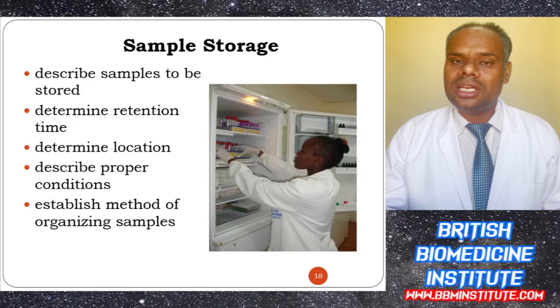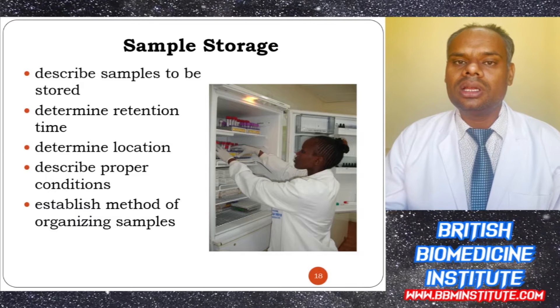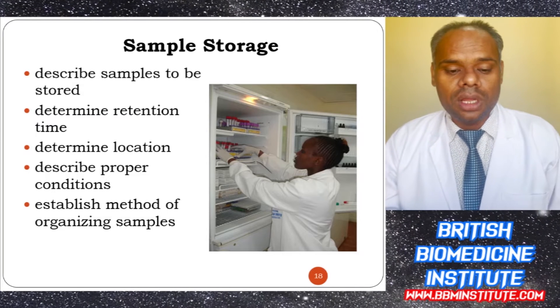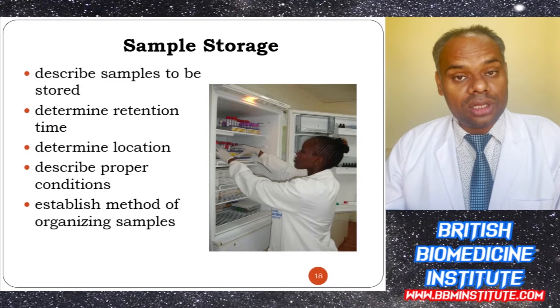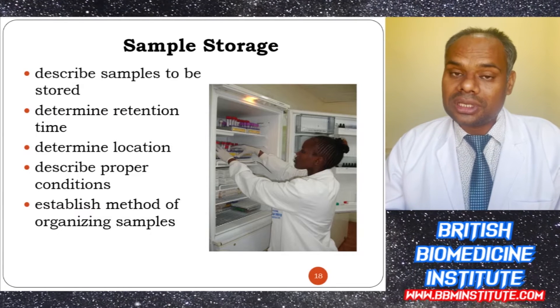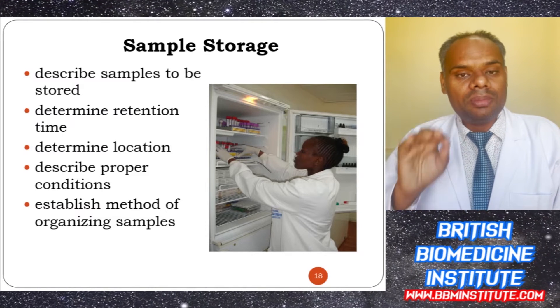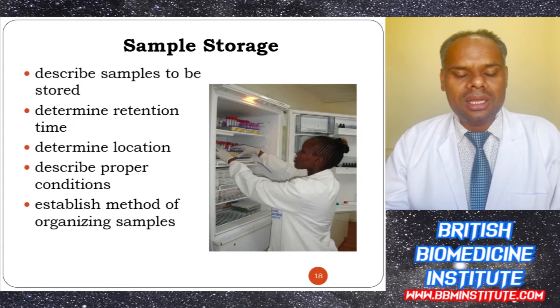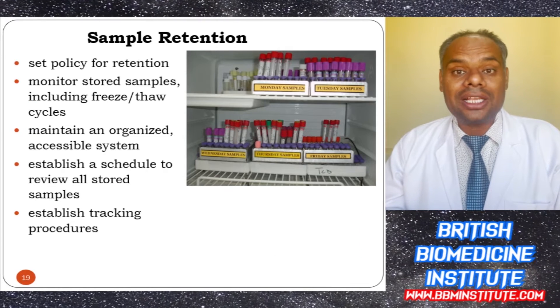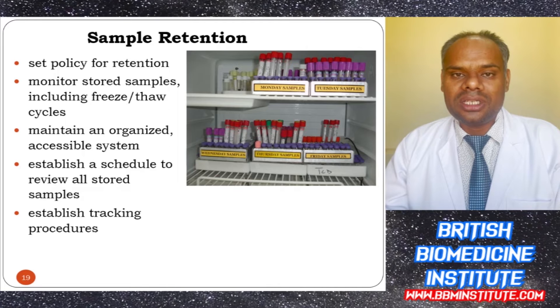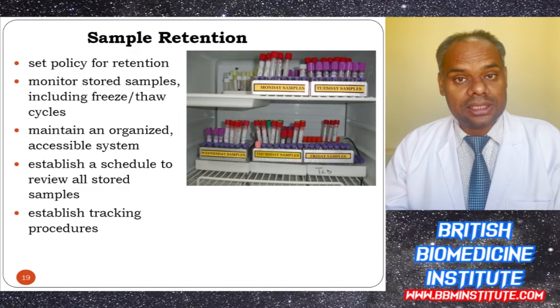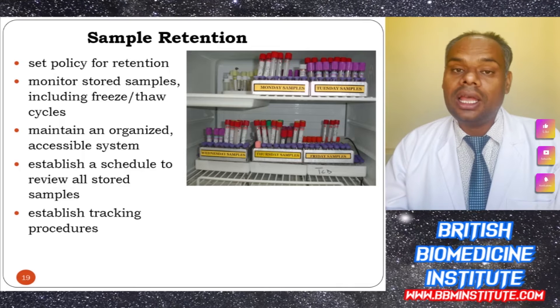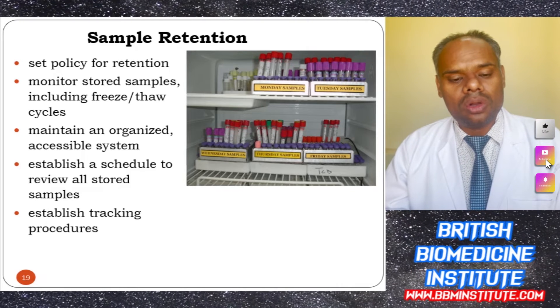Sample storage must be carried out in accordance with the required SOP. We have to determine the retention time, the storage location, the proper conditions for storage, and establish a method of organizing the samples. For sample retention, there must be a written SOP, and we must monitor samples including freezer and thaw cycles regularly, maintain an organized accessible system, and establish a schedule to review stored samples and tracking procedures.